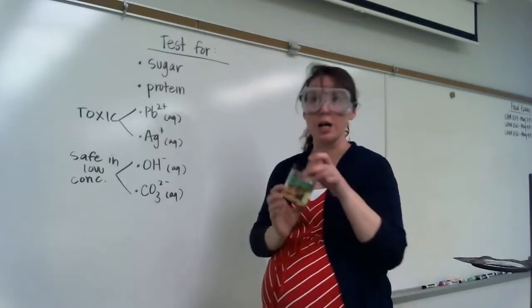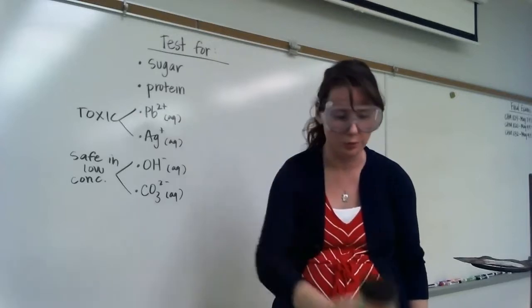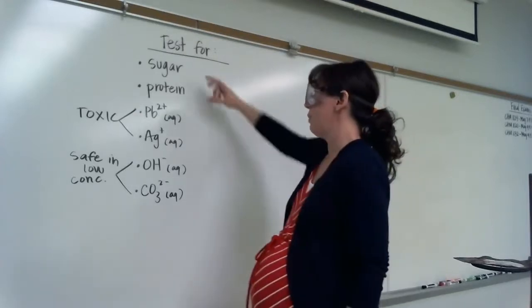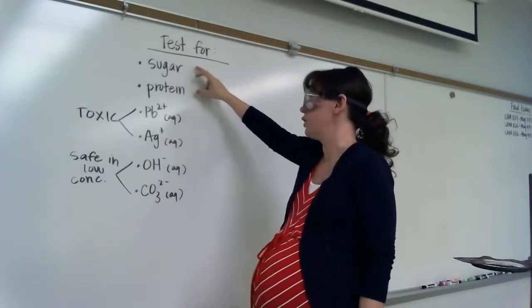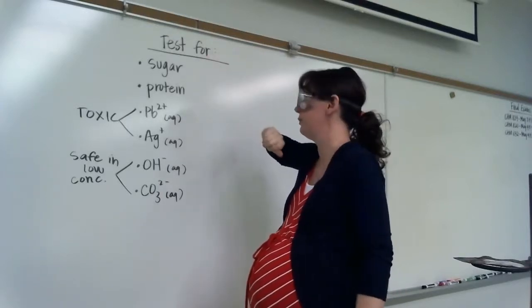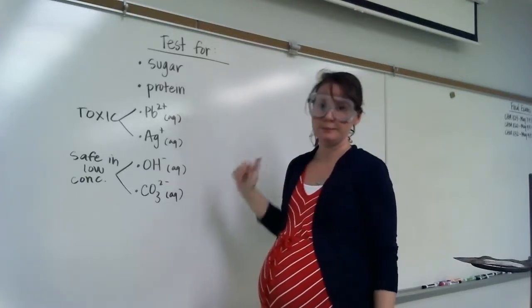Well, I know that there are frogs and turtles and fish and all kinds of things in that lake, tadpoles, bugs, right? Both of those are going to be generating sugar. Both of them are going to be generating protein, right? Your fish poop and all that great stuff, dead stuff breaking down. So we're going to test for sugar and protein.